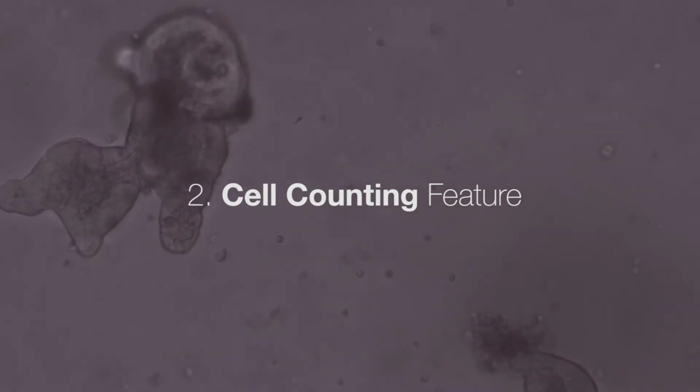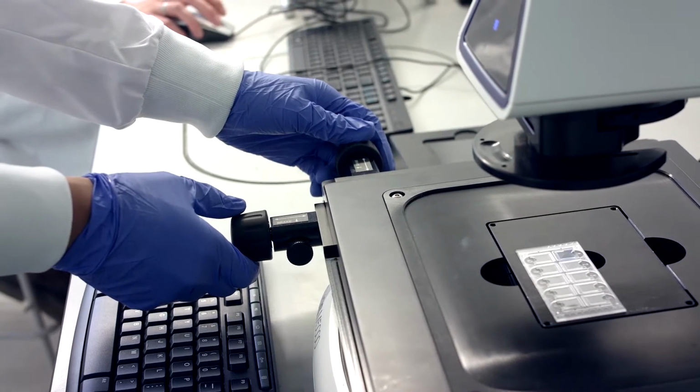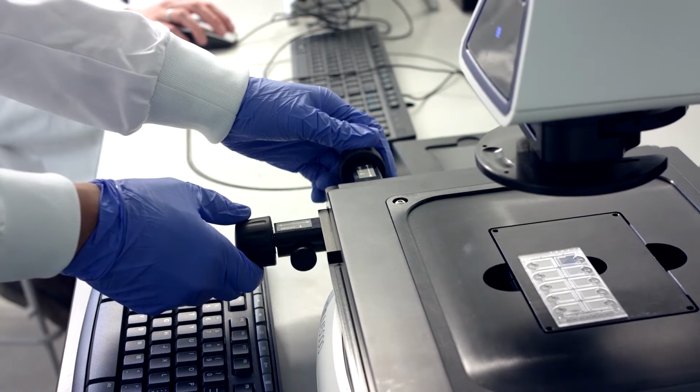Previously we did not have the cell counting feature, and that itself is a massive improvement, especially when you're working with monolayers and multicultures. If you've got different cell types in the same well, it's easier with the cell counting feature, where you can differentiate based on circularity or density of staining and everything to tell apart your different cell lines within the same culture.